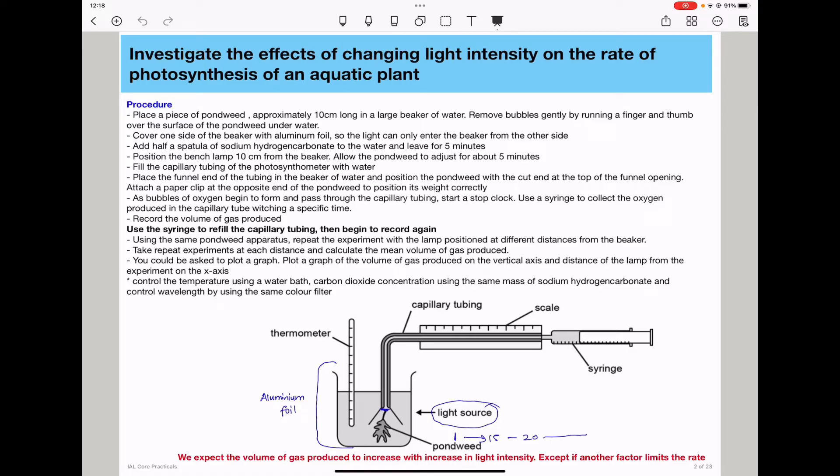Then we add half a spatula of sodium hydrogen carbonate to the water and leave for five minutes. The sodium hydrogen carbonate is there to act as a source of carbon dioxide because in photosynthesis, plants need carbon dioxide, they need water, they need a light source, and the correct temperature for photosynthesis to be carried out. So sodium hydrogen carbonate is used to provide carbon dioxide for the aquatic plant.